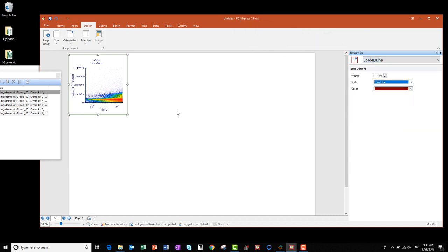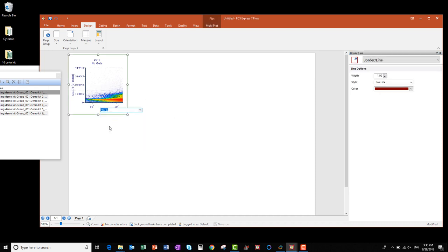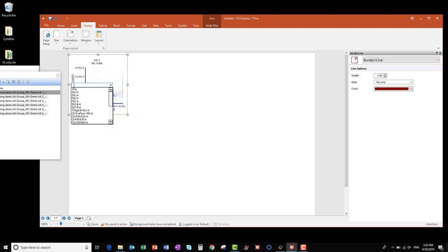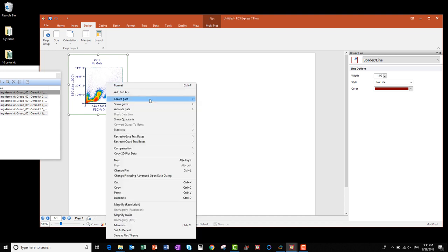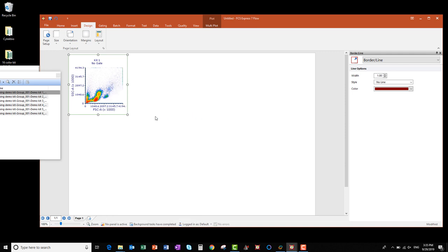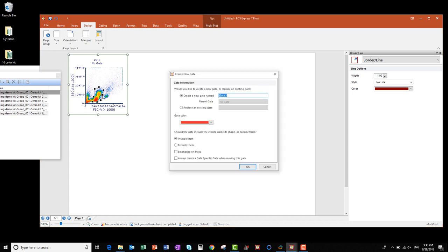I want this first plot to be a scatter plot, so I'll right-click on the X-axis label and change it to Forward Scatter Area, and right-click on the Y-axis label and change it to Side Scatter Area. Next, I want to create a gate, so I right-click on the plot, select Create Gate, and select Polygon. Then I click to place gate edges as I trace around the cells I want in my gate and click to close it. I'll call this gate Cells and click OK.